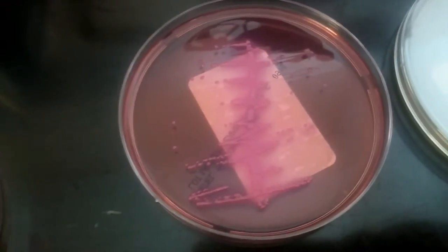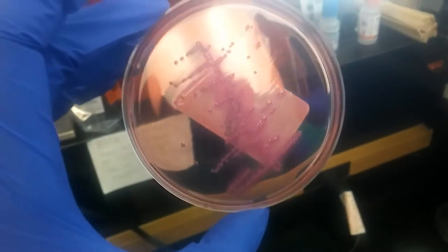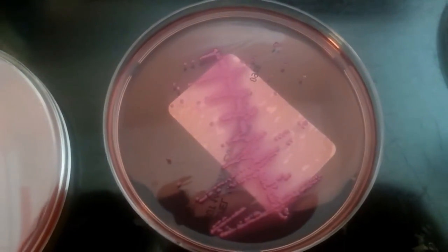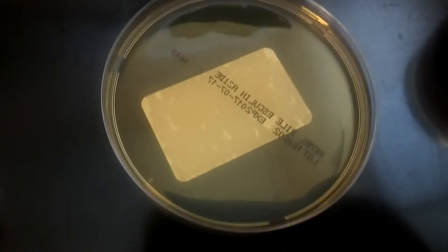We have the MAC plate, so pretty good growth, good color. There does look like there's some halo effects and spreading. There's that one. The BEA has no growth. Nothing grows.